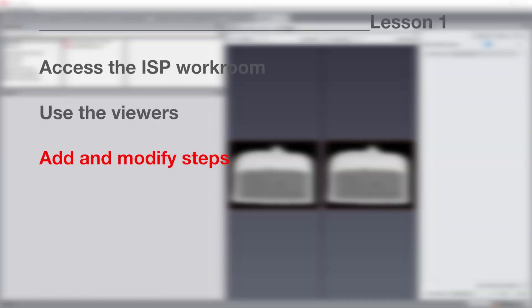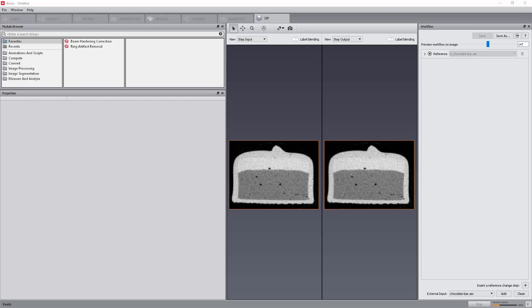We will now start creating our workflow. At first, we want to create a mask of the Nougat phase. The mechanism of adding a tool is as simple as selecting the tool in the Tool Browser. This selection will add the tool in the Workflow Panel and automatically apply it on the output of the preceding step with its default parameters. One can then test the parametrization and see the effect on the data.